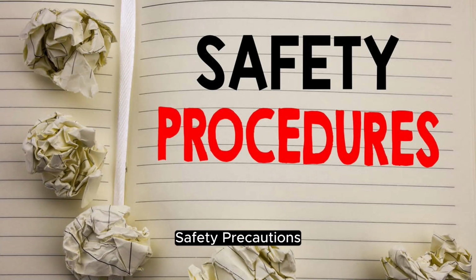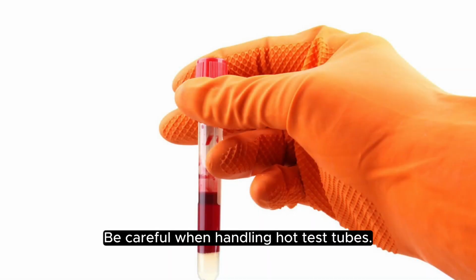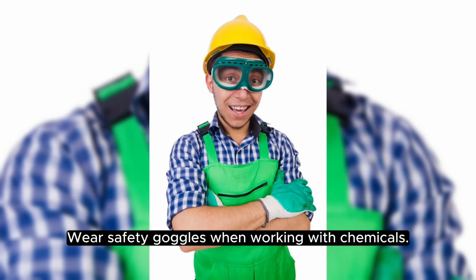Safety precautions. Be careful when handling hot test tubes. Wear safety goggles when working with chemicals.